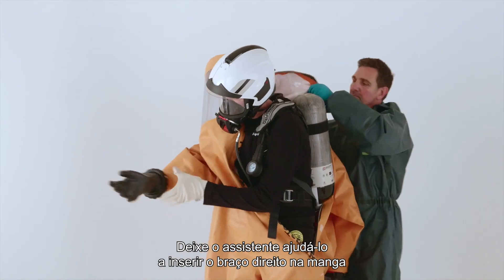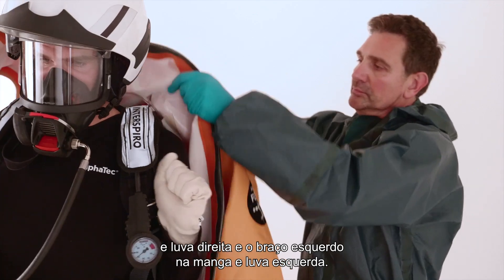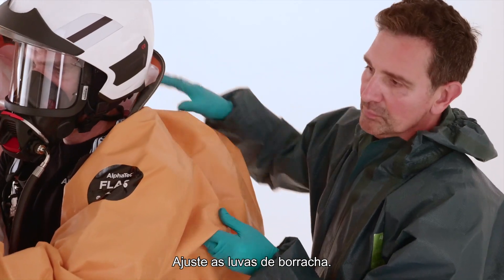Let the assistant help you to insert the right arm into the right sleeve and glove and the left arm into the left sleeve and glove. Adjust the rubber gloves.